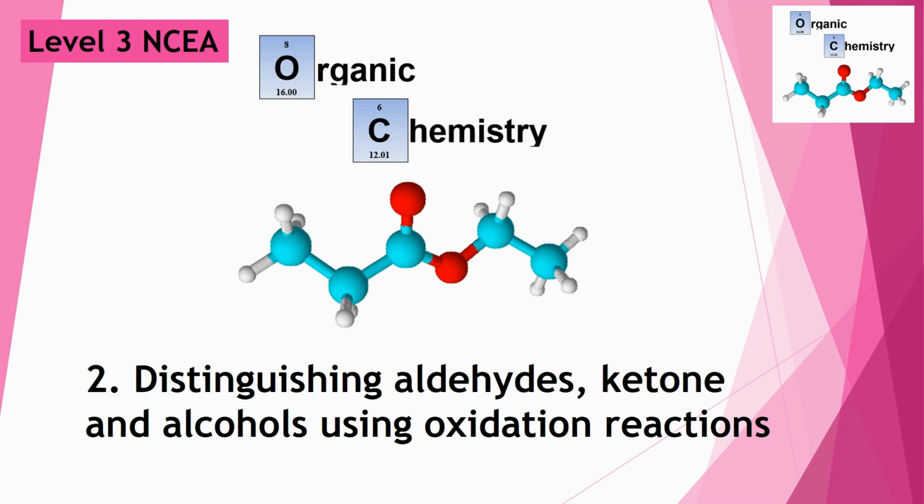In this video, we're going to look at how to distinguish aldehydes, ketones, and alcohols using experiments or little tests that we can carry out in the lab.